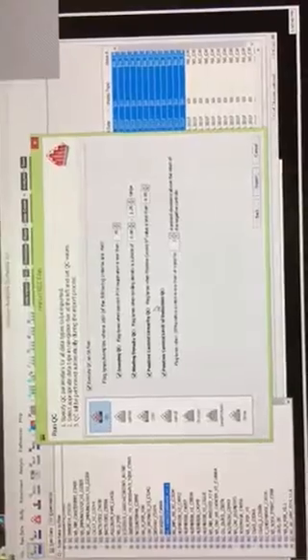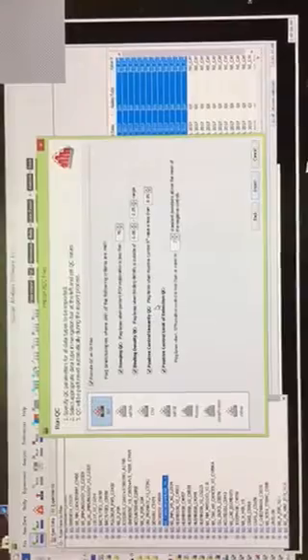This one here is positive control linearity. I don't know if you took a look at the Excel file, and we can look at the raw data again, but the positive controls are basically a fourfold dilution of each other. So it looks at the linearity of the positive controls. The linearity issue can mean a lot of different things, including a problem with the hybridization itself. So that's one metric.